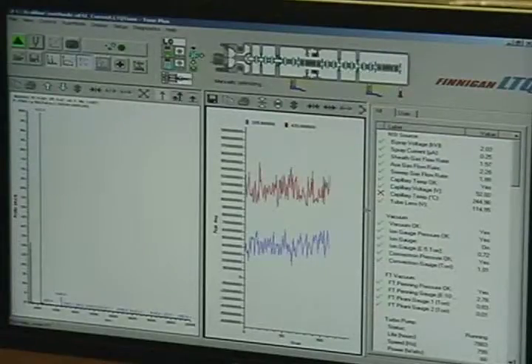So temperature shouldn't affect charge state distribution, or it should. It does. Yeah. Higher temperature should give you more 433, 649. Lower should give you more 325.